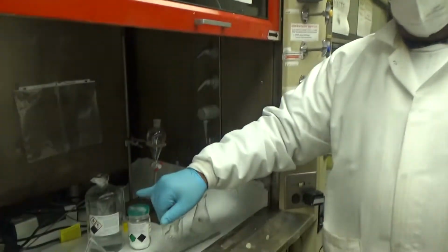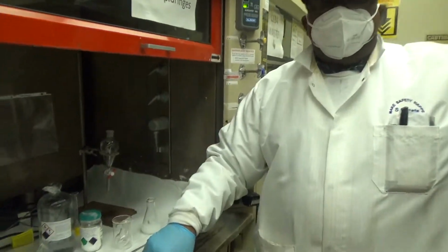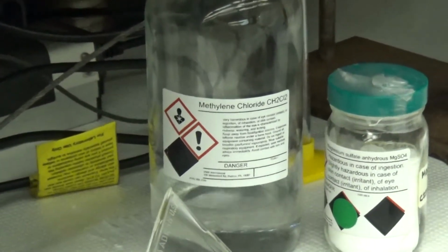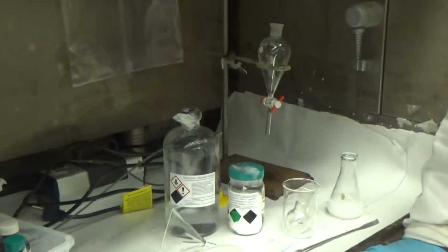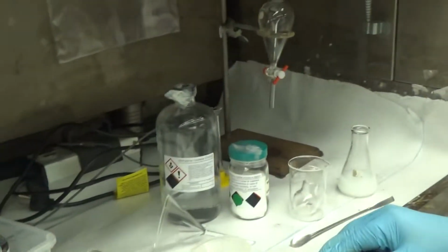We are not authorized to do this step at our benches, because it's a carcinogen, right? It's a carcinogen. It'll give you cancer, so you have to work within the hood to avoid the toxicity. So this step must be done in the fume hood.